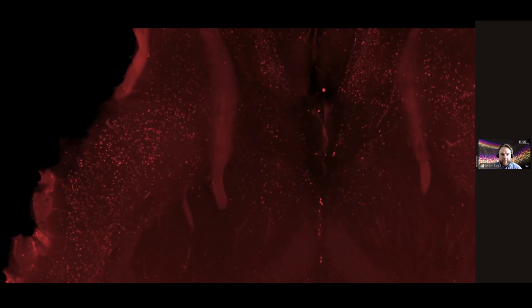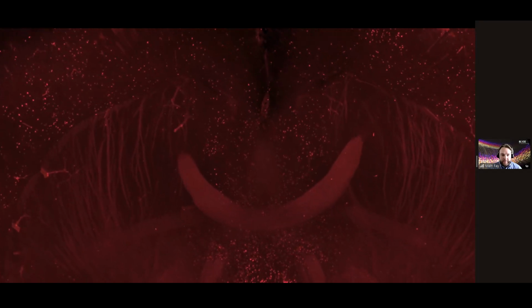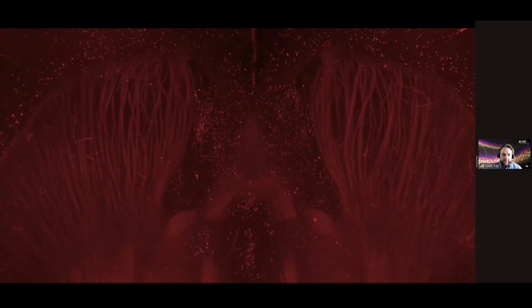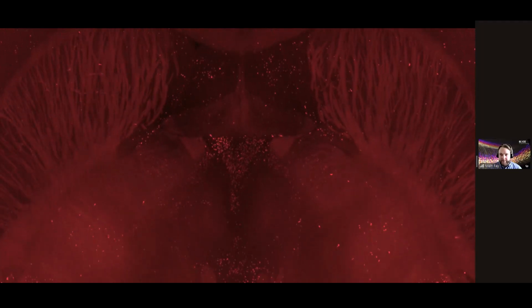This image was acquired with a 10x over 0.28 NA imaging objective and an 8 micron axial resolution. This video may appear jumpy over the Zoom screen share, but it's available on our website if you'd like a closer look.